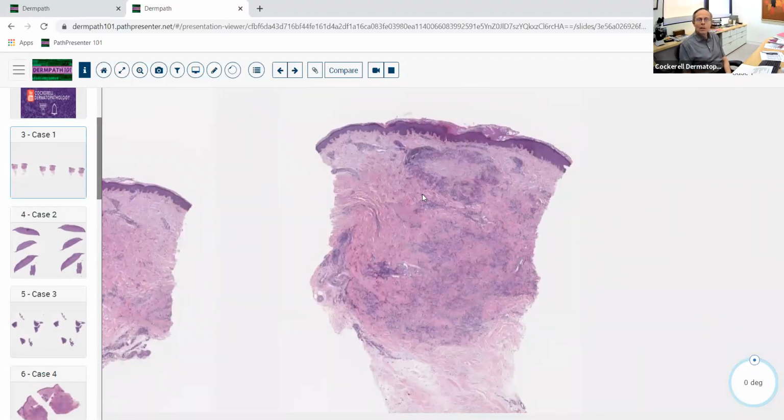There are 5 patterns of histologic granulomatous inflammation that you need to know about. So hopefully you guys either know that by heart. If you don't, you need to learn it by heart. But basically, there's palisaded, there's the sarcoidal, there's tuberculoid, there's foreign body, and then there's suppurative. So we have all those 5 patterns that we see under the microscope. And so when you look at granulomatous inflammation, we define it as histiocytes predominate, at least focally, in the infiltrate. And so when you see that, you can get it into one of those 5 categories, and then you can come up with a specific diagnosis.